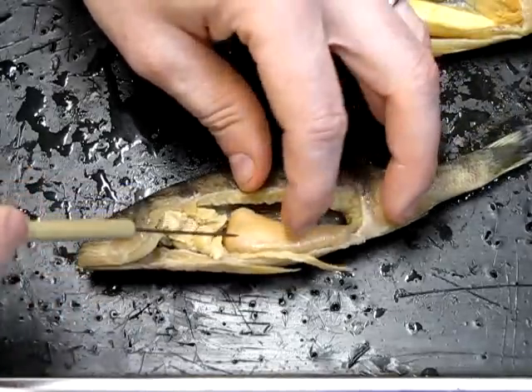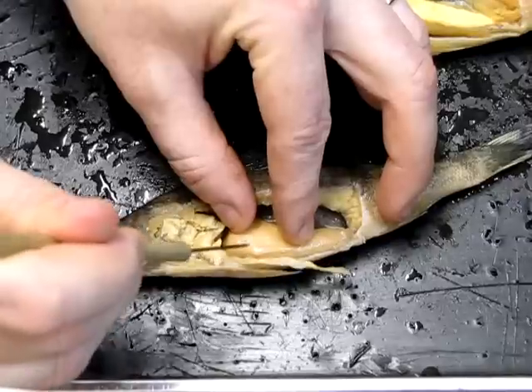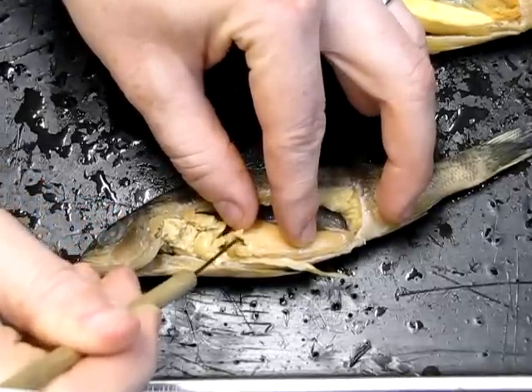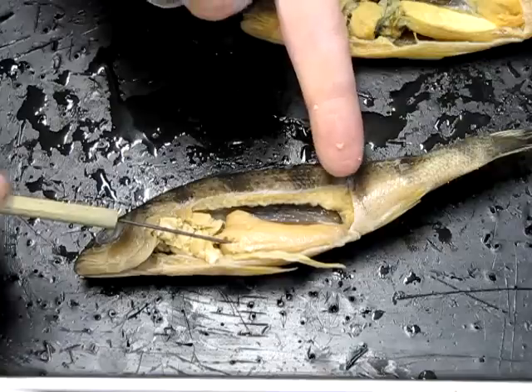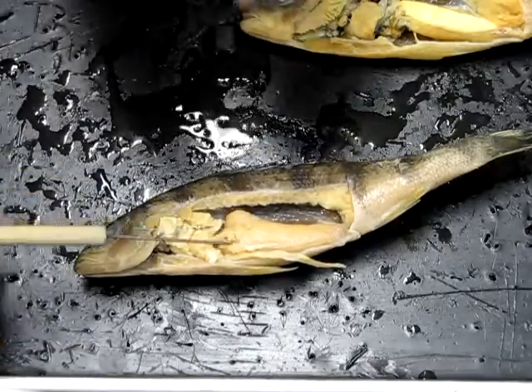This large structure here — if I break into it a little so we can see the texture — it has a very caviar-like texture with little eggs. This is the female gonad, the ovary. There is only a single ovary in the fish, and we'll see how that differs from the male in a moment.